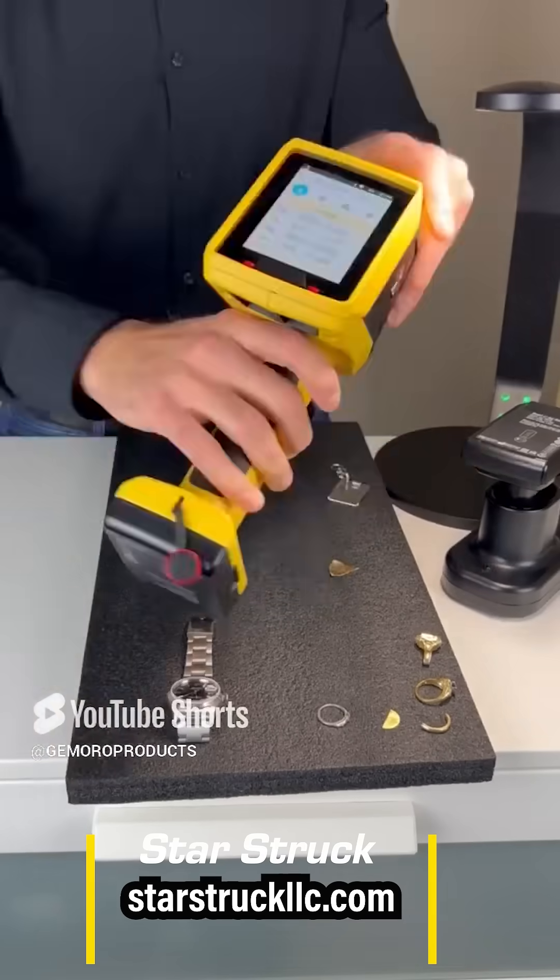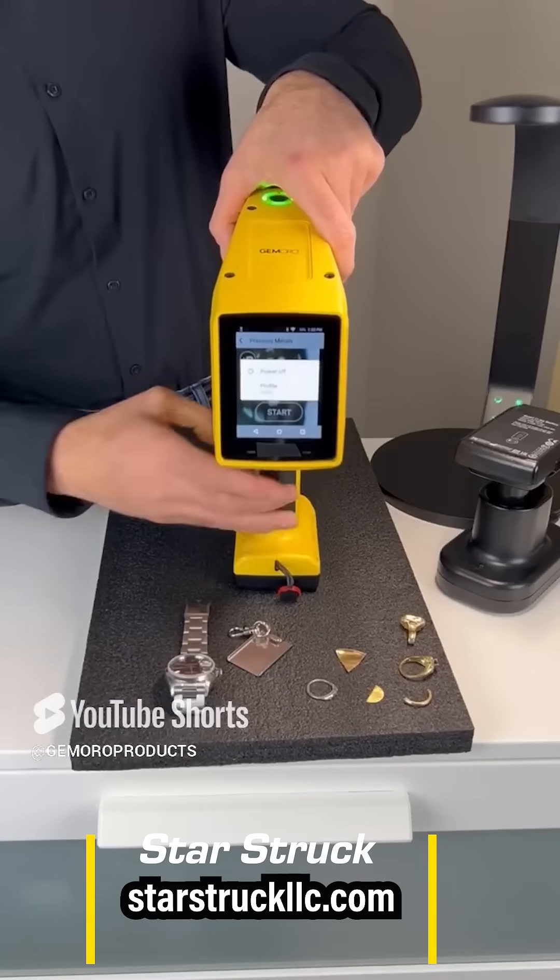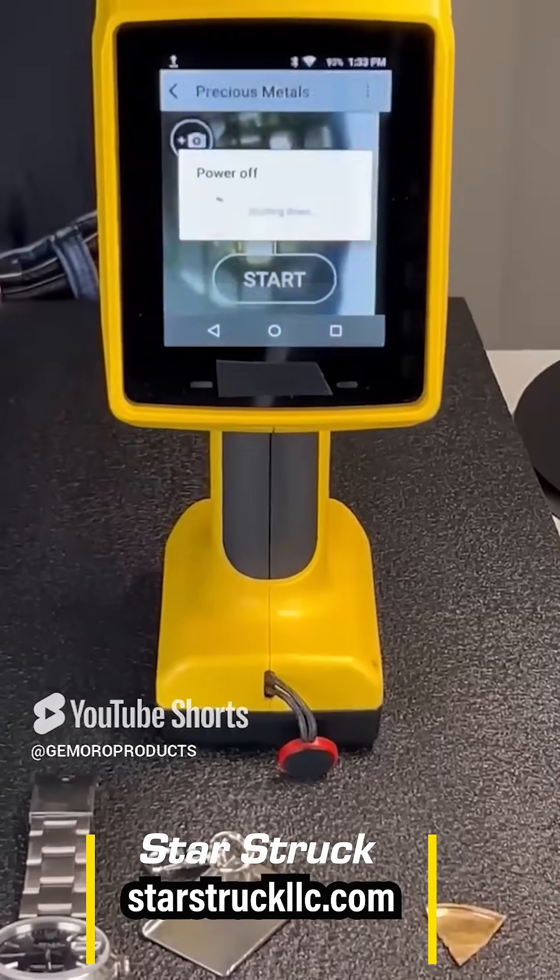The first test showed 13.83 carat, and we tested another spot that's been filed and it said 11.27 carat. Gotcha — plated. No problem. 10 seconds per test.